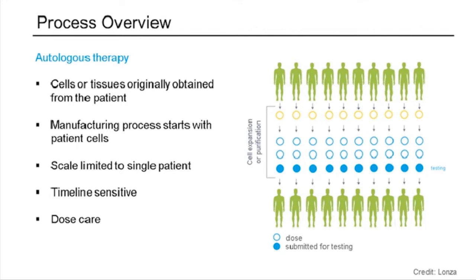However, with this comes a number of complications, as you might imagine, specifically around logistics. The patients may be heavily treated by the time that this therapy goes to be used, so the cells that you are harvesting from the patient may not be of an ideal quality. And then the logistics around just this process in general, harvesting the cells from the patient using something like apheresis, transporting from the hospital to a processing facility. Then you're going to be processing the cells, which include a number of different steps. This whole processing timeline might take 19 or 20 days.